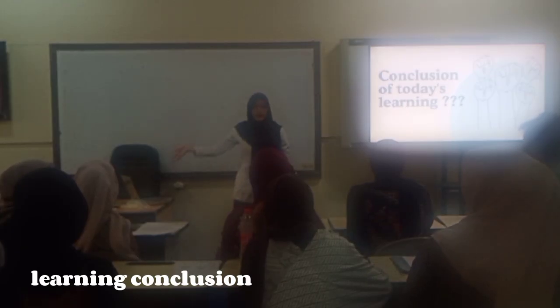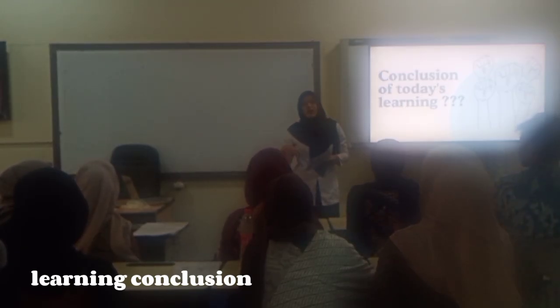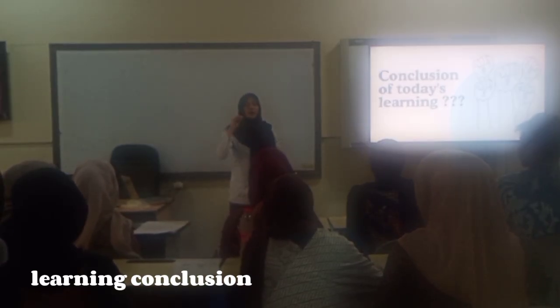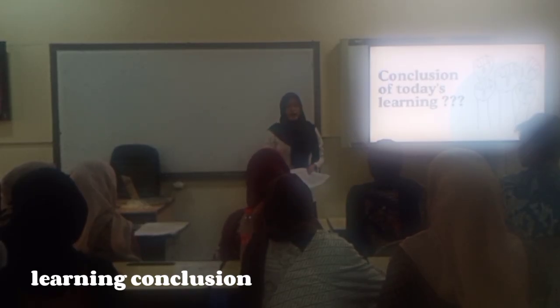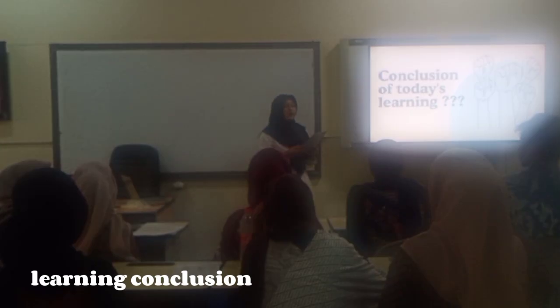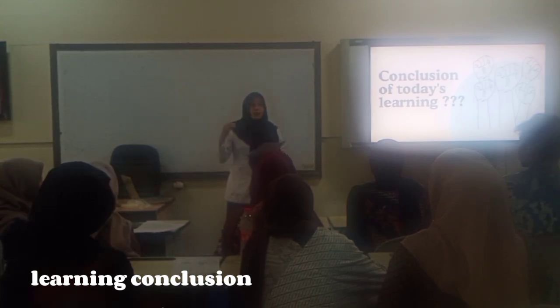Through the DNA experiment using strawberries, you didn't just learn theory, but you did a hands-on experiment to understand better. You thought DNA was just something microscopic, but you can see it with your own eyes.